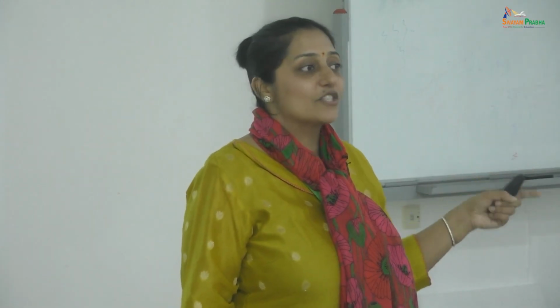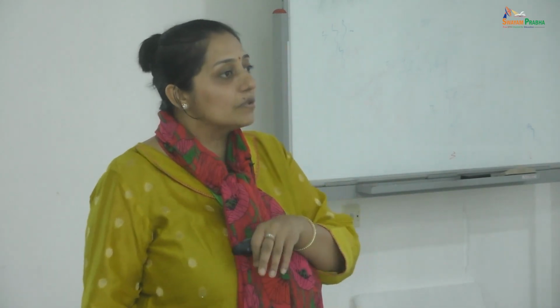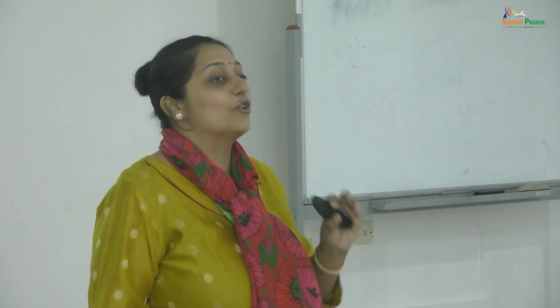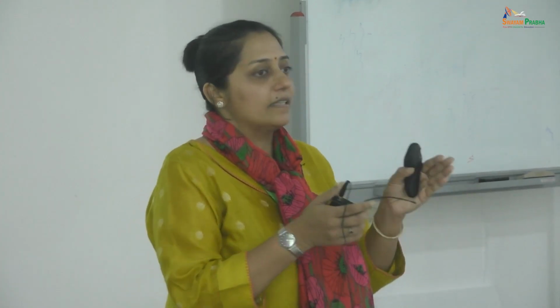First, what is important? Before you came to the reactor part, what were you doing? You were trying to establish the kinetics in the shake flask. You were trying to collect the data. You were trying to understand your culture requirements. So before you even come to the reactor, when you are establishing the kinetics for secondary metabolism, you must know whether it is growth associated, non-growth associated, or mixed growth associated, so that you can decide whether you have the liberty of a two-stage cultivation. Maybe I need to have one reactor clubbed with another reactor design.